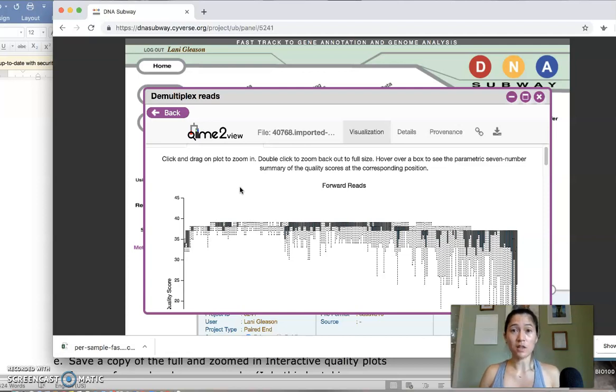What that means is that each fragment of DNA that you're sequencing is sequenced from two different directions. That's why you have this forward read and also this reverse read. It's very similar to when we talked about PCR, how you have a forward and reverse primer, and then you're amplifying the DNA region in the middle. It's a very similar concept here.